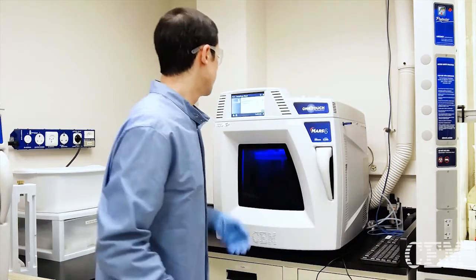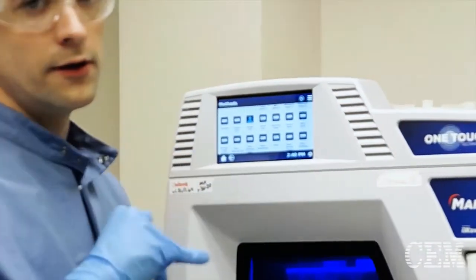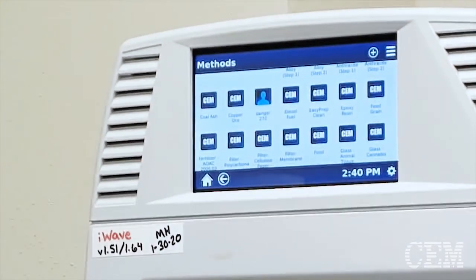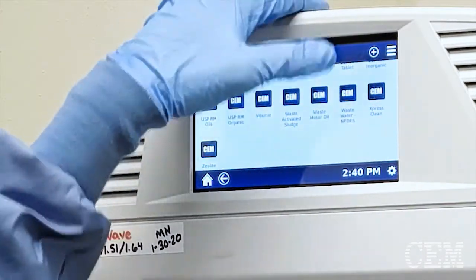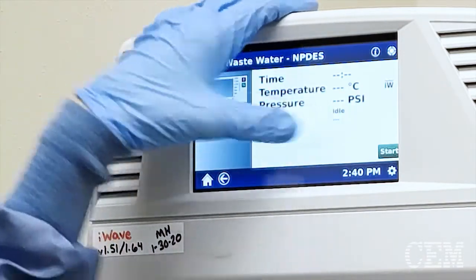All right, now you need to go into your one-touch directory and pick either Express Clean or Easy Prep Clean. Obviously, you use Express Clean with Express vessels, and it cleans at 150 degrees. It's all the way at the bottom, where the X's are. Or you would use Easy Prep Clean if you're using Easy Preps or iPrep vessels, and they clean at 180 degrees C.